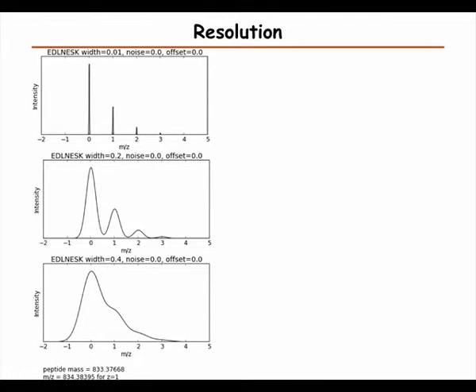So here is an example where ideally we have very thin peaks. This is the isotope distribution, but if we have less resolution, the peaks widen, and sometimes they widen so that we can't really resolve the different isotopes, but here we just have a little shoulder for the second and the third peak.